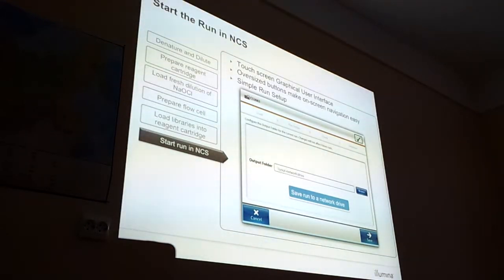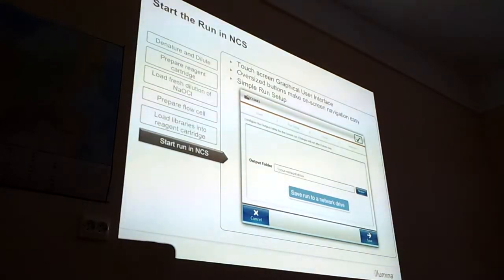Because, for example, as we discussed before, if there is a misconnection in the intranet or internet, then it would be saved directly on the disk, but you should not choose the disk by default. So you should try to use a different location outside of your local computer.